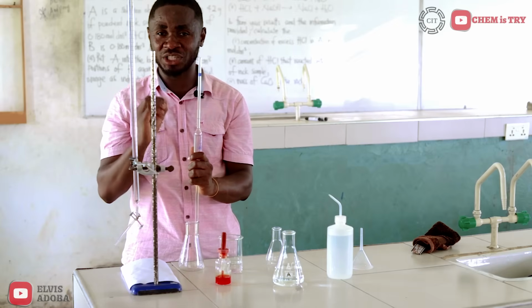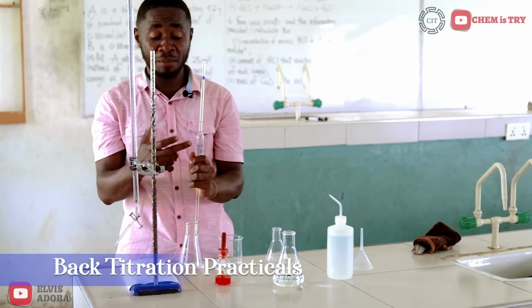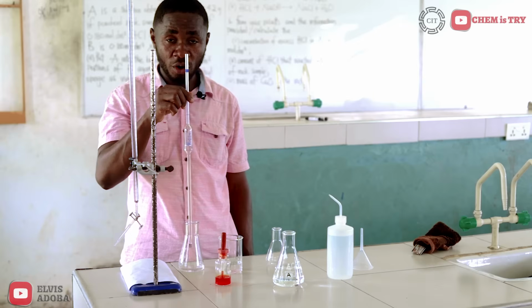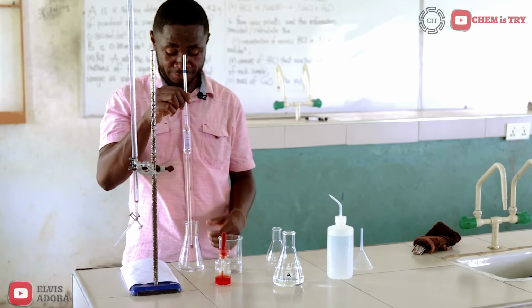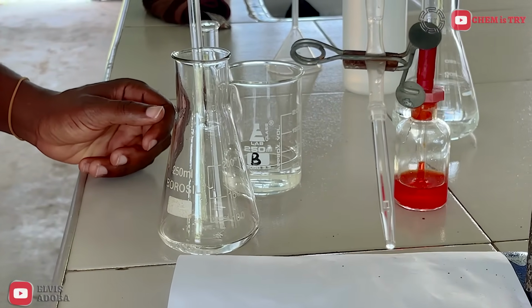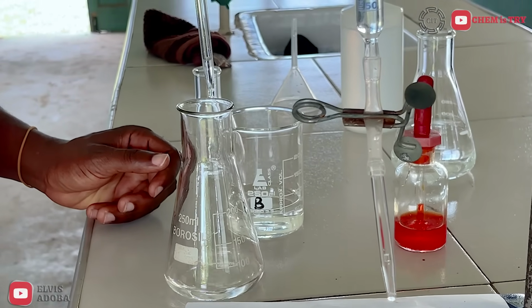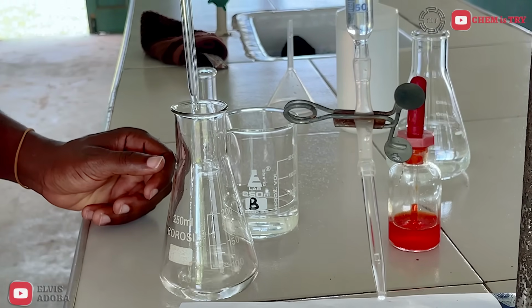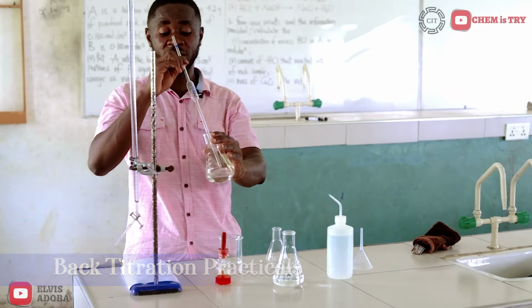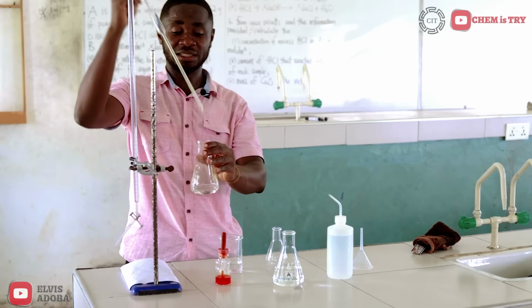And I allow it to drop gently by gravity. I don't blow air through my pipette because the air could contaminate my solution. So I wait patiently for all the solution to be released into the conical flask. I do have some few drops at the tip of the pipette. So I just gently hit the bottom of my conical flask with the tip of the pipette to discharge those small drops. That's it.